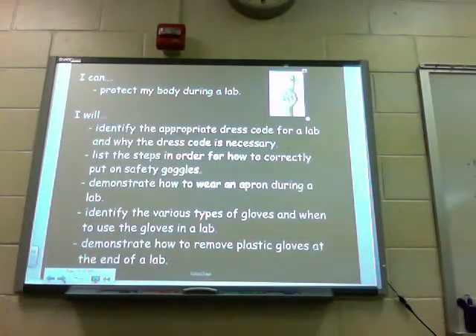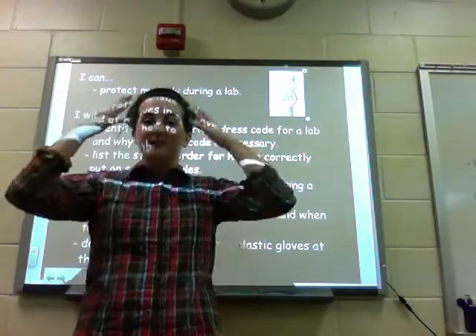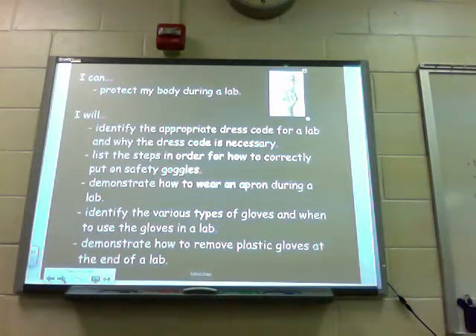We've come to the end of our episode and we hope that you can say: I can protect my body during a lab — meaning your dress code is set, your face is protected, your hands are protected, and your body is protected. I will identify the appropriate dress code for a lab and why it is necessary. I will list the steps in order for how to correctly put on safety goggles. I will demonstrate how to wear an apron during a lab, identify the various types of gloves and when to use them, and demonstrate how to remove plastic gloves at the end of a lab.